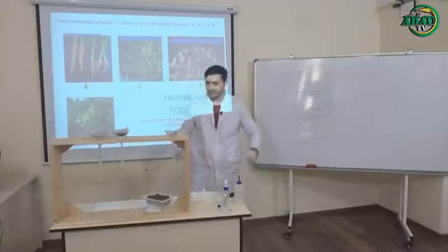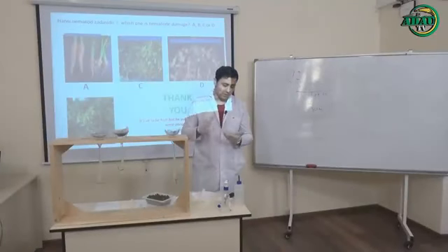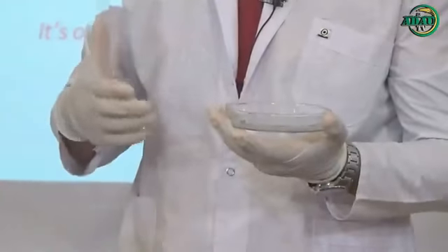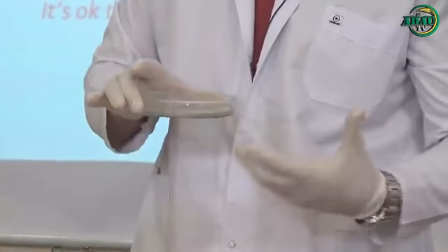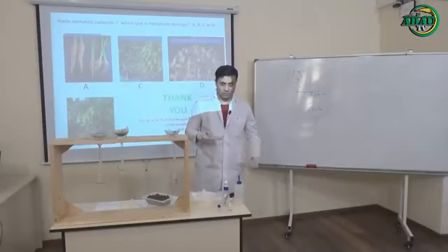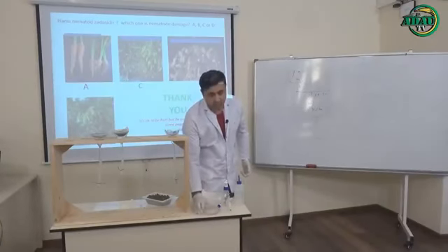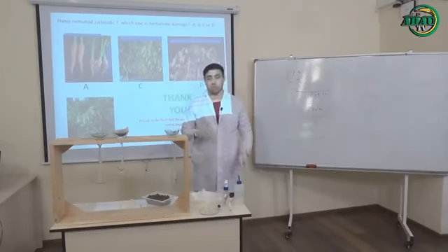And I am sure that you will see a lot of nematodes, as I said to you before, but you have to be sure which one is a pathogen nematode. Sometimes it is difficult to see the nematodes under the microscope, and if you do not have a particular microscope for nematodes, you can use, actually I use, these methods. This is not the usual method, but you can use it, and it is enough for diagnosis because we have to know which nematode is pathogen and which one is non-pathogen.